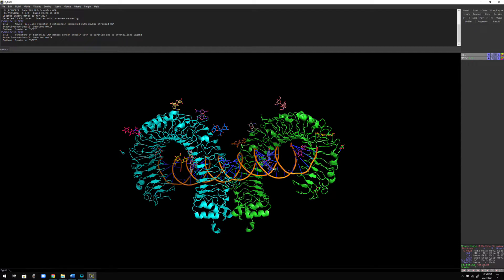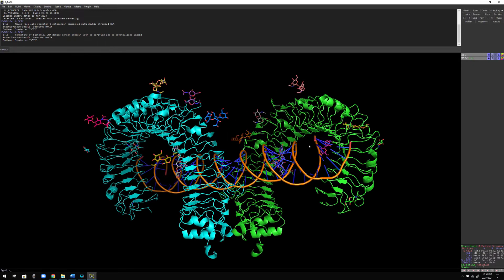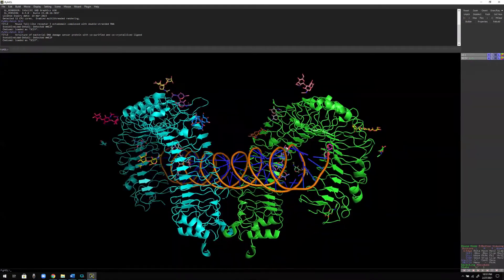I'll show you using UniProt and also using the Protein Data Bank, but it is very handy if you use this particular command that I'm going to show you in this video. Using PyMOL and that specific command, you can extract the FASTA sequence, and if you delete any part of the protein you can still extract the FASTA sequence of the remaining part — so it becomes really useful when you're trying to analyze the structure.